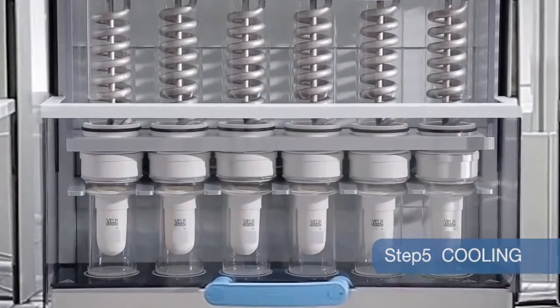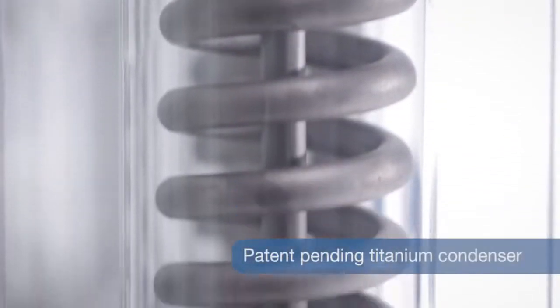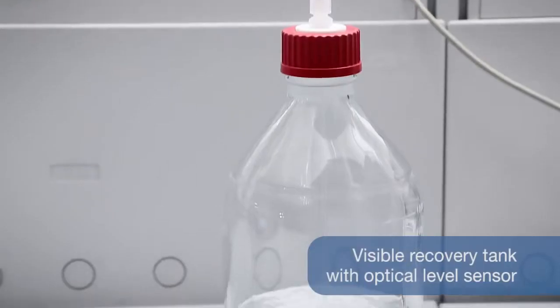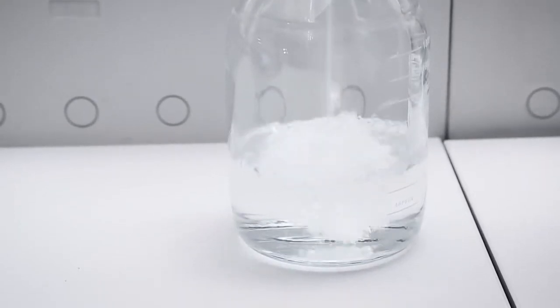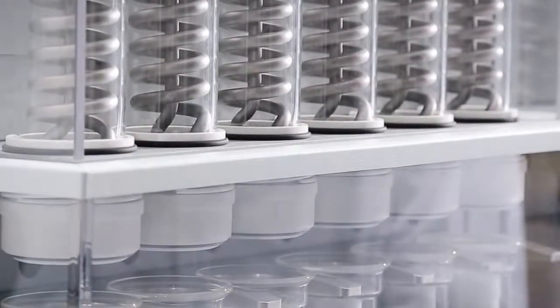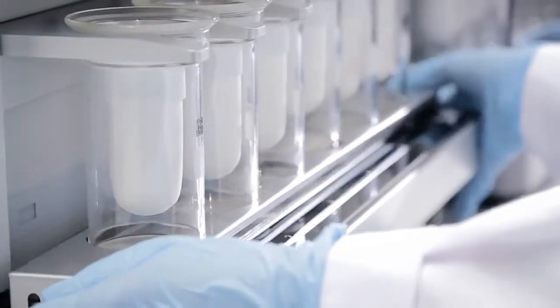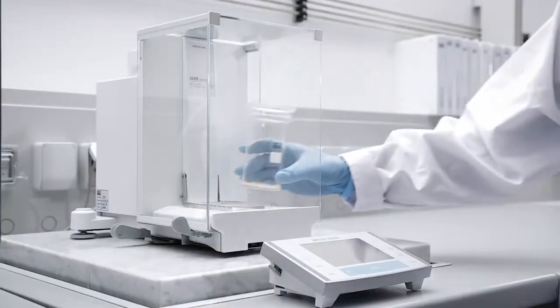The final step is the cooling of the extraction cups containing the extracted matter. The cups are raised to prevent burning. Titanium condensers ensure minimal cooling water consumption and excellent condensation. The extraction cups containing the extract can now be placed in a drying oven, cooled in a desiccator and weighed.